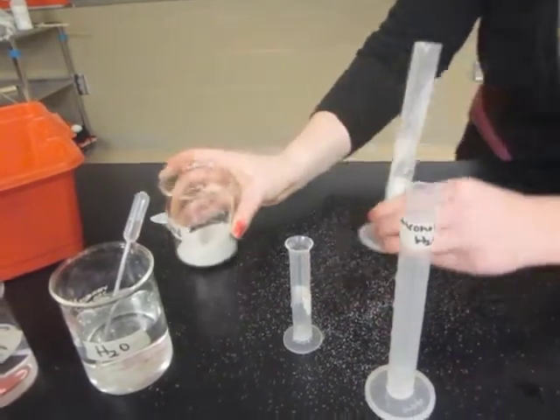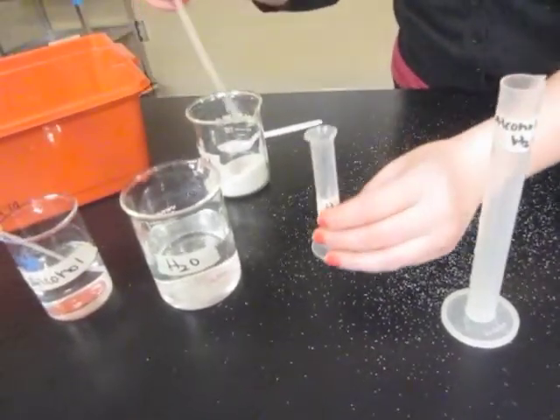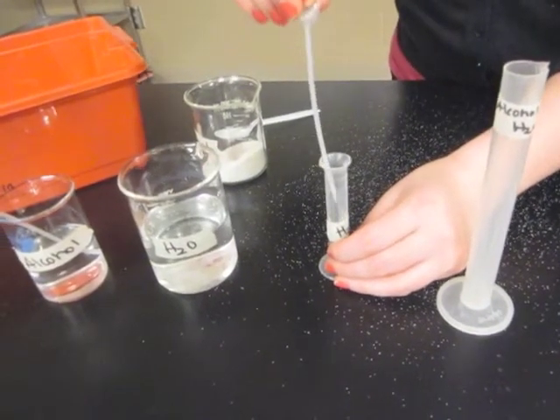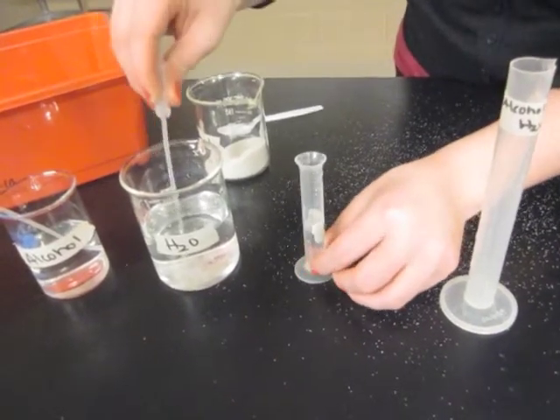There we go. Alright, the next thing you want to do is fill your water graduated cylinder with 10 milliliters of water. You want to use the pipette when necessary because you don't want to spill water everywhere or whatever other chemical could be in your beaker.